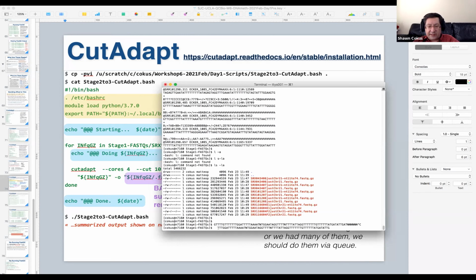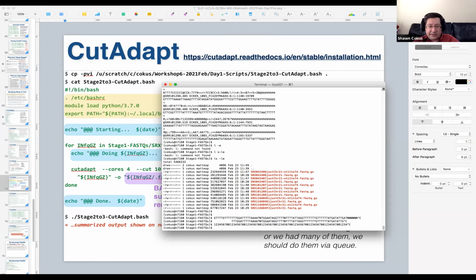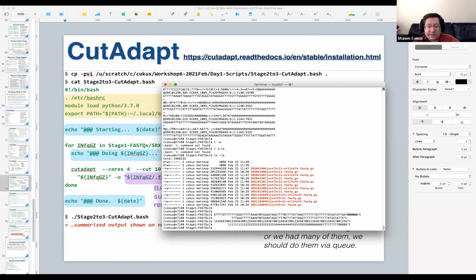And now we're going to align them. Find out where these align. Oh, there we go. That looks pretty good. And what bases are these? Okay, here's a little ruler. That's 10, 20, 30, 40, 50, 60, 70, 80, 81, 82, 83, 84. And now we need the tens digit. Sorry, the tens digit's going to be on the second line and not the first line. Okay. 5, 6, 7, 8, 84. Okay, where does it line up?